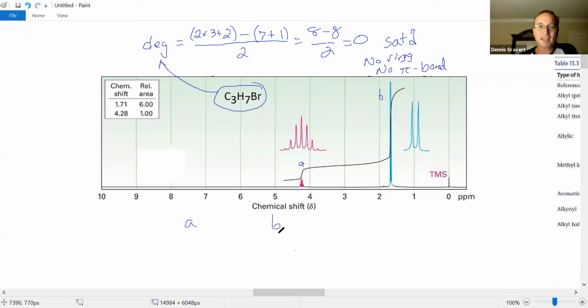There's peak A and peak B, 2 peaks. So there's 2 equivalent hydrogens, but there's 7 H's. So there's a lot of equivalent hydrogens in here, giving us these 2 peaks. Okay, that's the number. Next would be position.